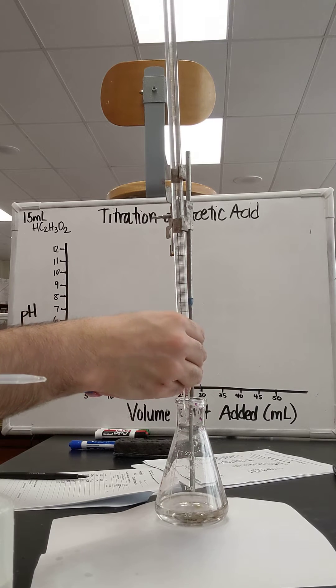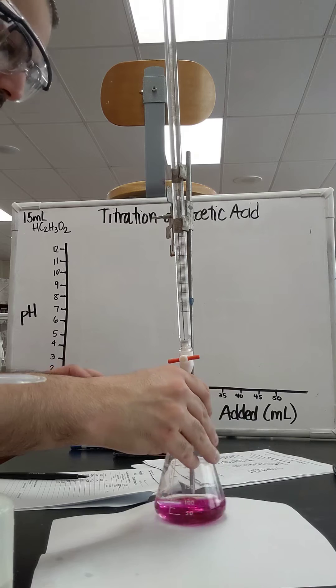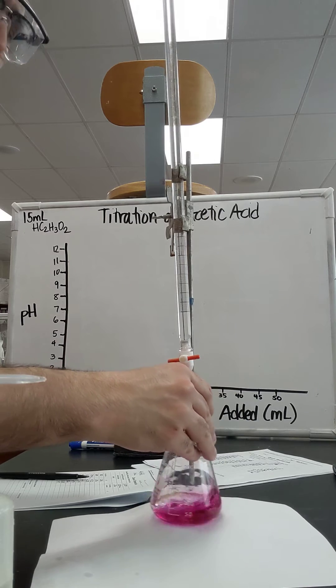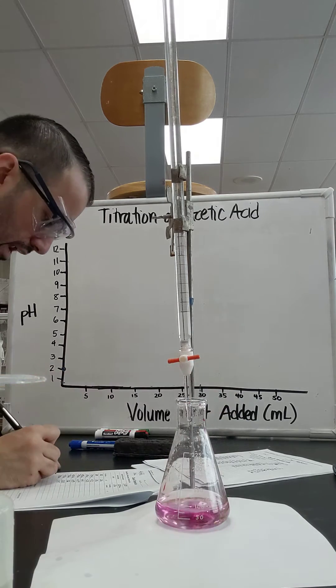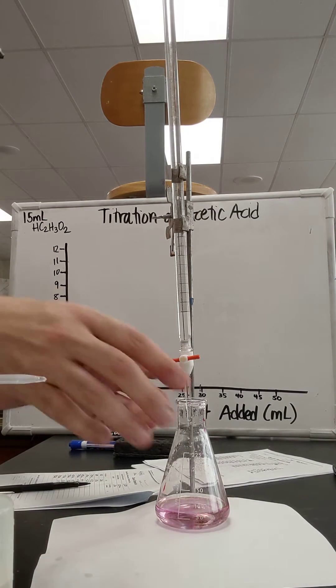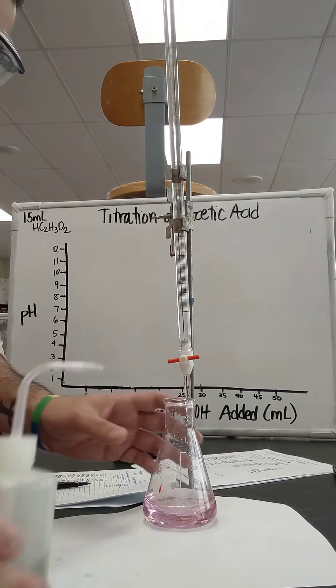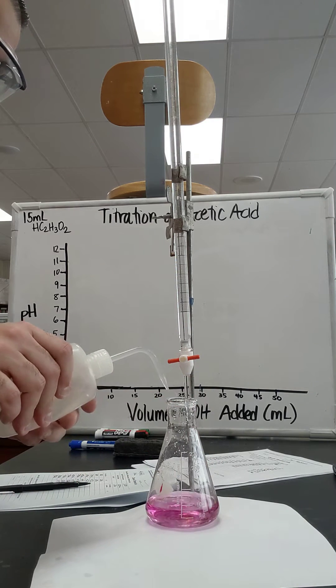I'm going to drop another 0.5. Actually, I dropped a milliliter, so I got 9 in here now. And I went way past the end point. I'm at 9 milliliters. Well, actually, no, it's going away. Swirl, swirl, swirl. That's why you swirl. I'm going to add a little bit of water. Adding a little bit of water.